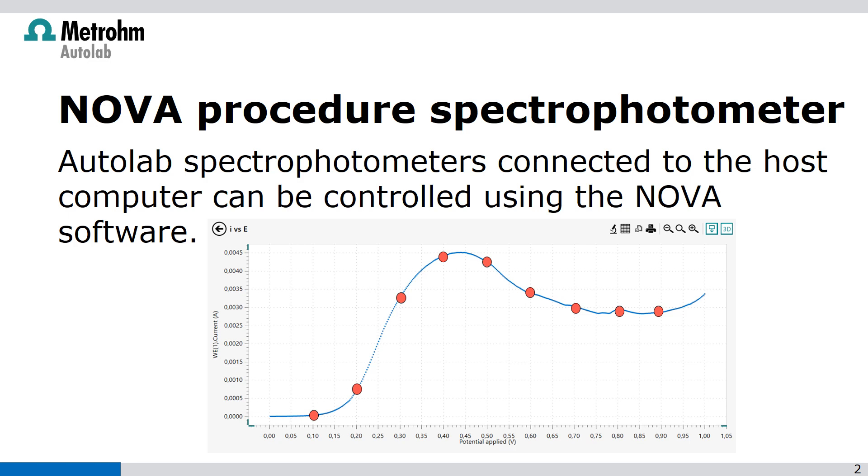We're going to measure a linear sweep voltammetry and with fixed interval time we're going to take a spectrum during the LSV.